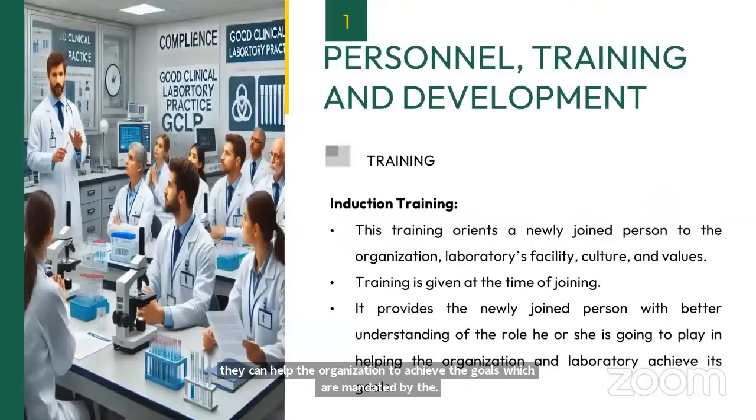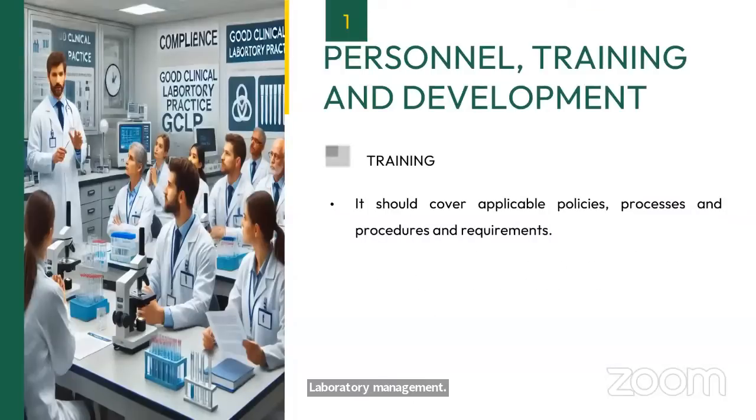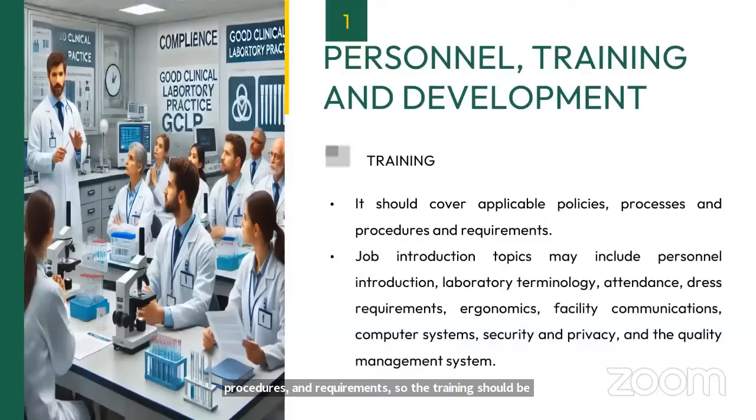Now, this training should cover all the policies, processes, procedures, and requirements. So the training should be comprehensive and it should cover all the necessary areas. Job introduction topics may include personal introduction, laboratory terminologies, attendance, dress requirements, ergonomics, facilities, communication, computer systems, security and privacy, and the quality management system. So the training should include all the necessary aspects.